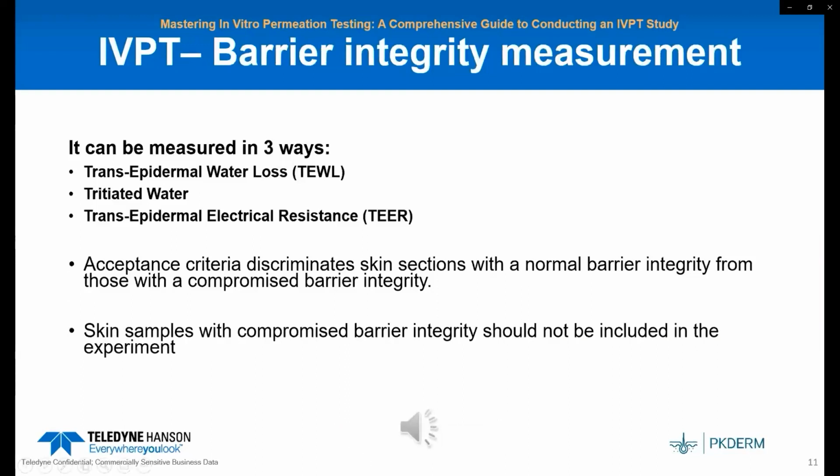Transepidermal water loss, or TEWL, is a quality indicator of skin barrier integrity. So, when performing an IVPT, we need to check the barrier integrity for each skin sample.